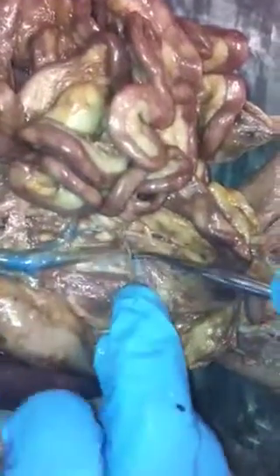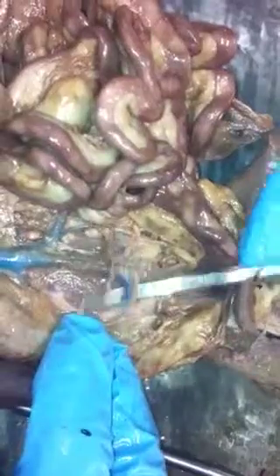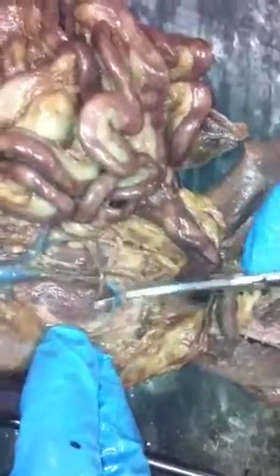Lumbar. And another lumbar somewhere. Anyone that branches out a lumbar. This is iliac. Which one, the red or the blue? Same, both of them. I mean, iliac vein and artery right there.